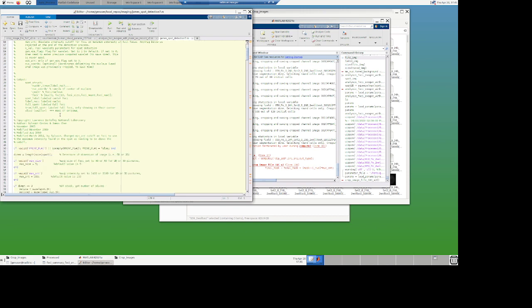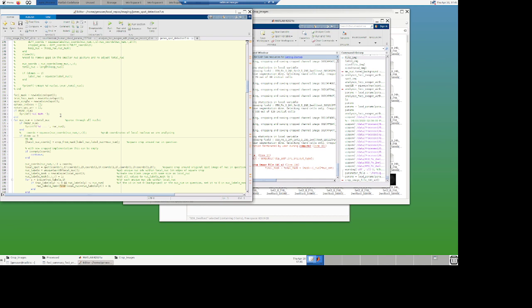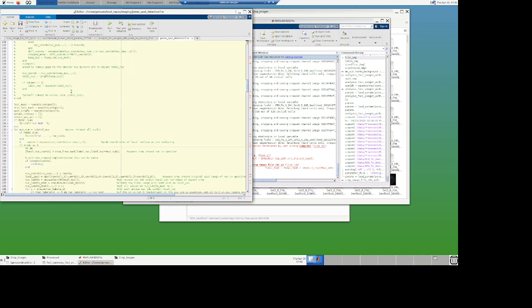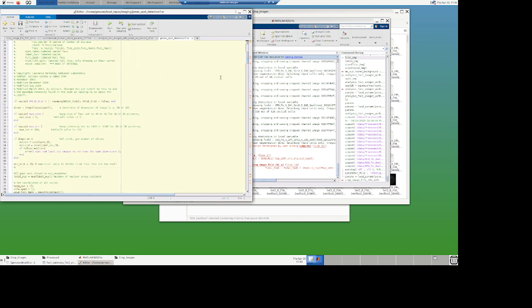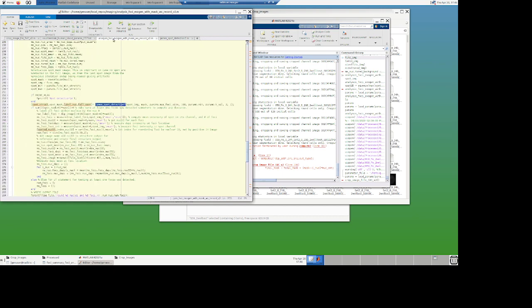That's calling more functions. There's a wavelet somewhere, where is it? Just look at that. That's what I would like to recode in Python. This whole spot detection is there. But maybe we can do even better with other AI tools. So that's where we are with this. But I think I gave you quite a bit already.